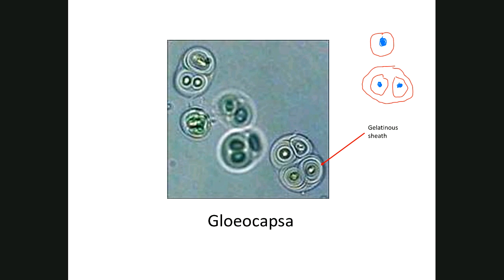So let me highlight that. Here you have one cell, another cell, and here you have a gelatinous sheath for one, here's another one, and then you have the original one for those two, and you have a gelatinous sheath that puts all these together.